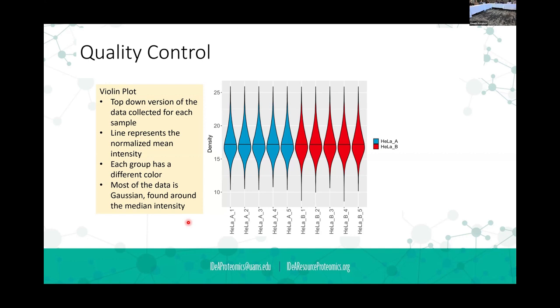And if you saw that, then you would know, okay, the assumptions I'm making in the normalization are not correct, because I don't expect a twofold change. And that's why it's difficult to normalize on a pull down, where you're pulling down with a scrambled vector or a target for your protein. You're going to get very different answers. It's difficult to take those proteins and normalize them because they're different, right? And the assumption isn't that they're the same with minor differences. There are huge differences. So my follow-up question is, for pull down, you do not normalize.